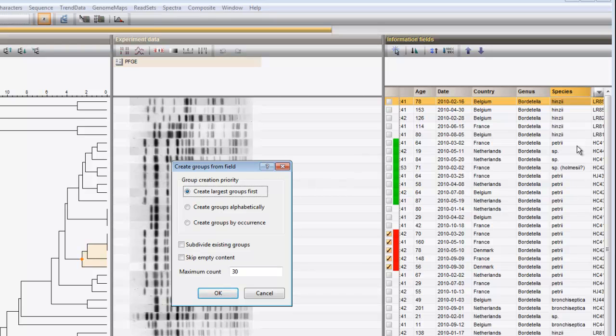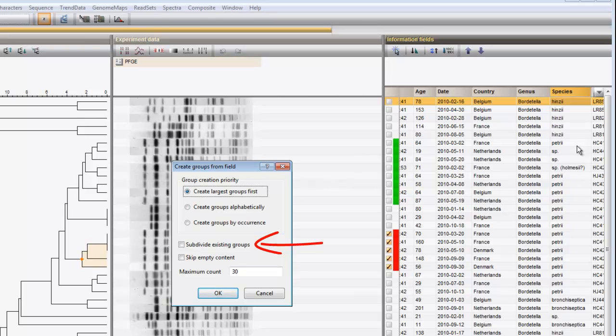Several options are available here, including what to do if there are more classes in the field than the maximum number of groups, or what to do when groups are already present, or how to treat empty fields. I can leave all options to the defaults and press OK.